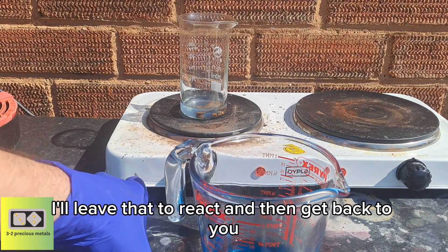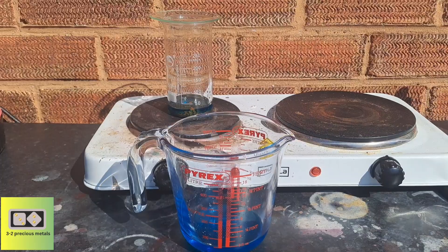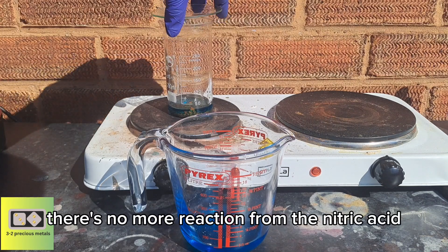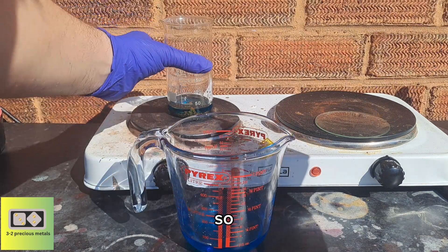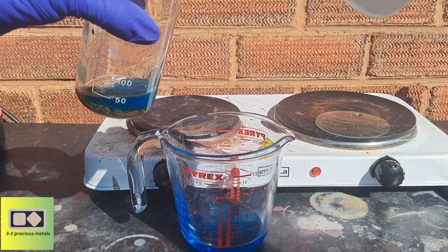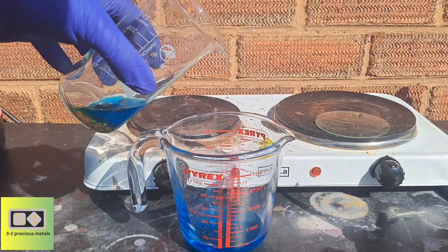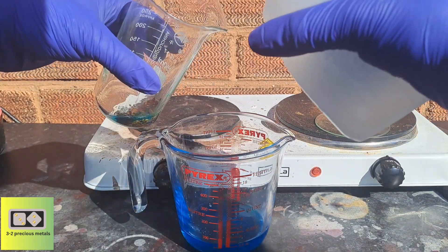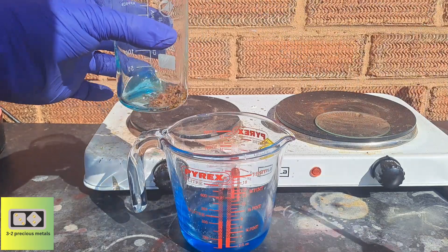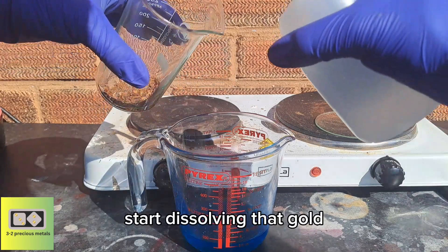I'll leave that to react and then get back to you once that's finished. The second batch is complete — there's no more reaction from the nitric acid, so I'll get it washed off, make some aqua regia, and start dissolving that gold.